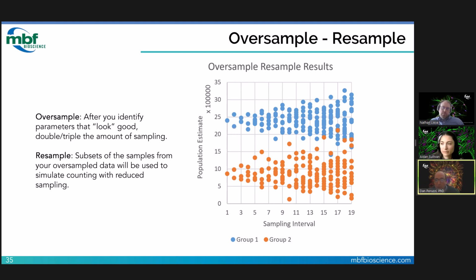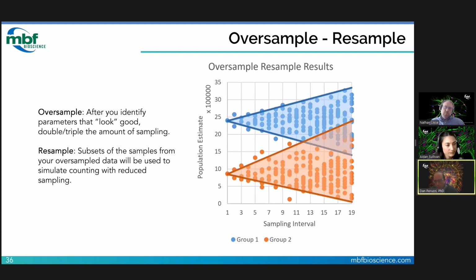And that might be okay, because what we can do is examine these 2 graphs as cones, and then find kind of the sweet spot here, which is represented by this green dotted line. And we want to be to the left of this green dotted line. So let's say we were at 5 on the x-axis. That means we are reducing our sampling by a factor of 5, either for sections or for sites.